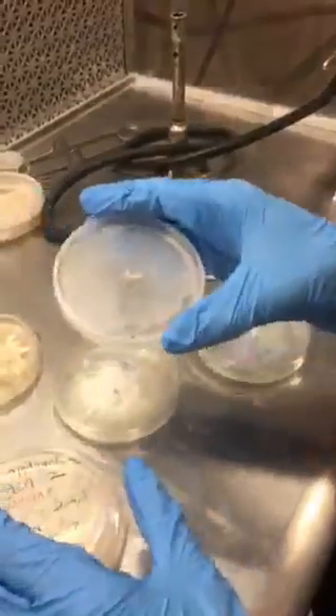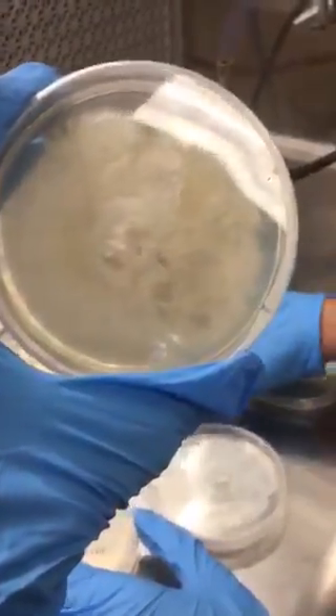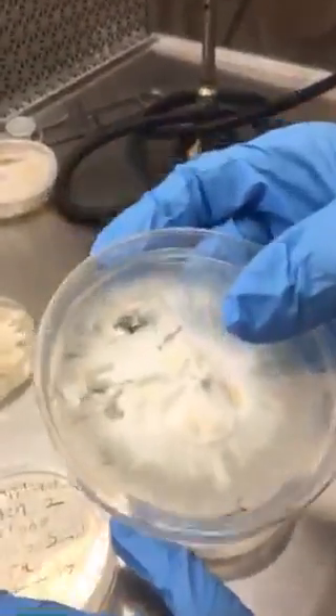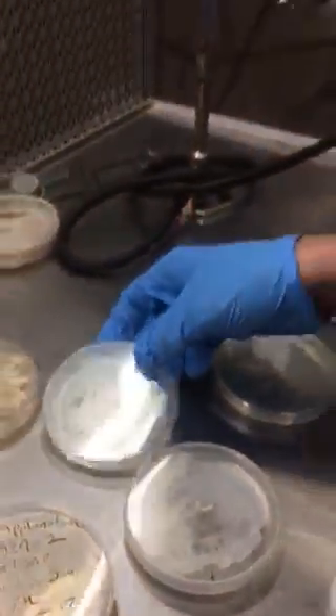This will be a sample dish. And eventually it will get this — that will be the final product. Dishes that look like this are the first-gen strain. Yeah, thank you. Awesome.